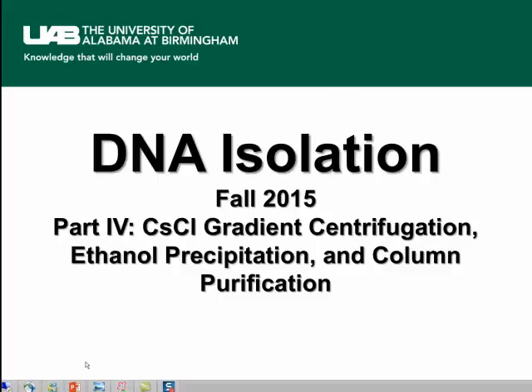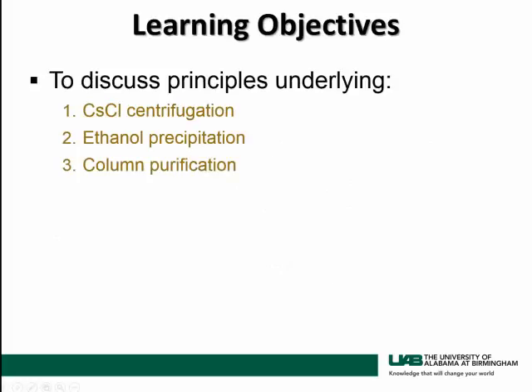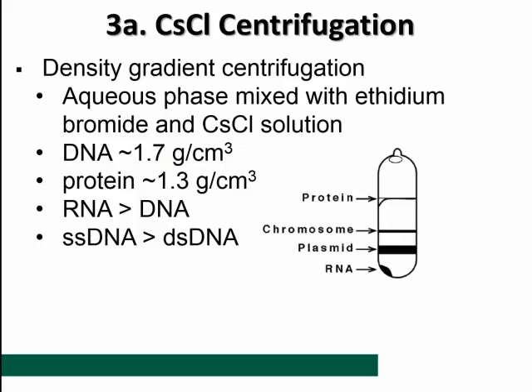The learning objectives are that we're going to discuss the principles that underlie the 3 procedures we're going to look at to purify the cleared lysate, and that is cesium chloride centrifugation, ethanol precipitation, and column purification. We begin with cesium chloride centrifugation.